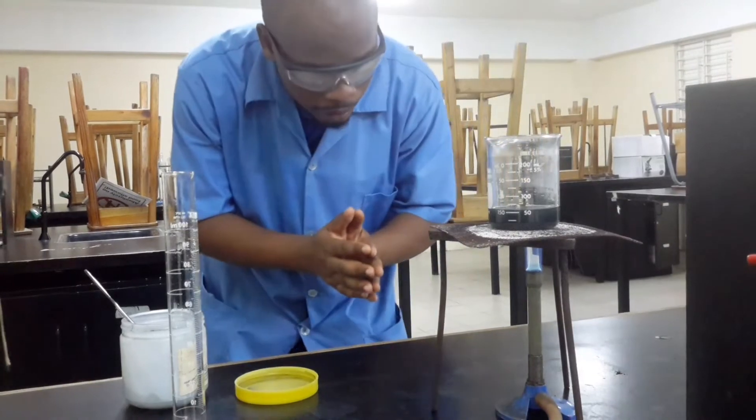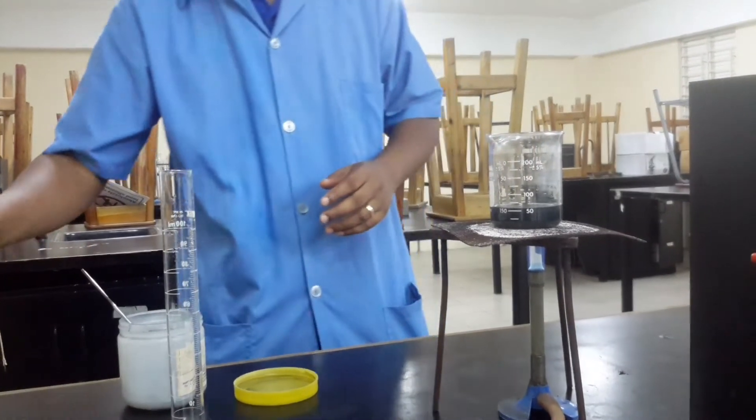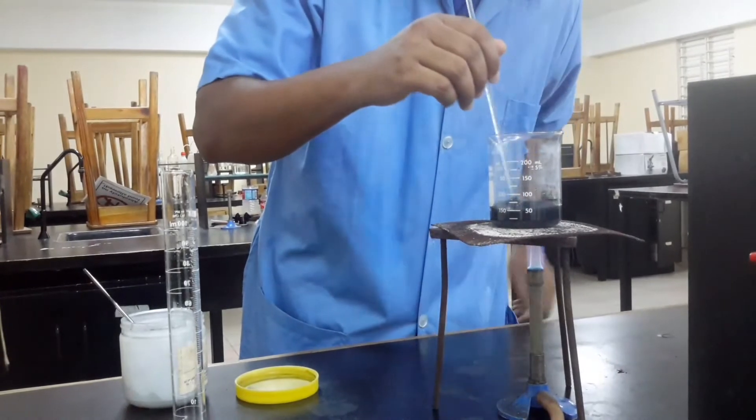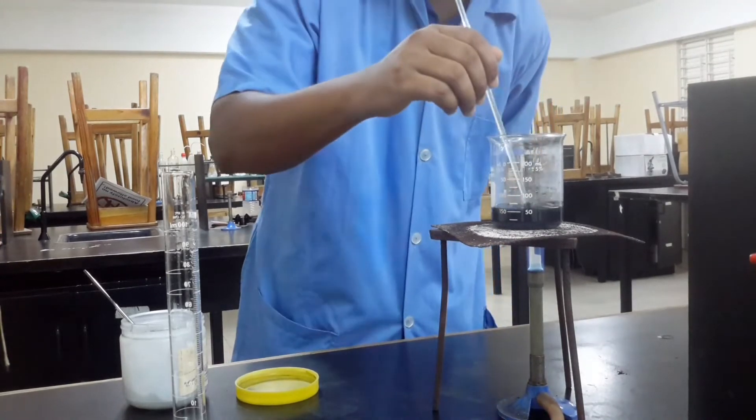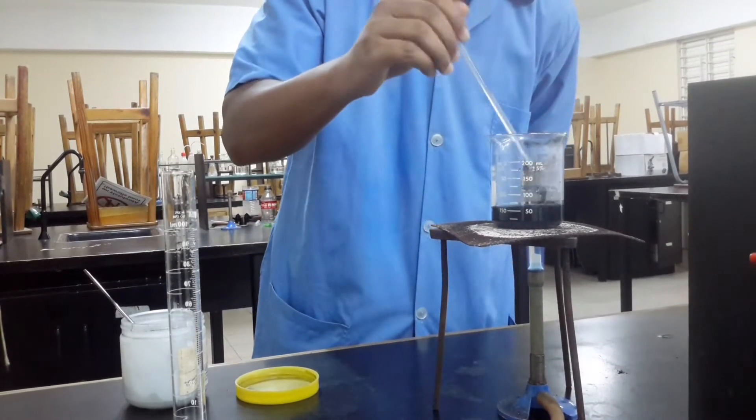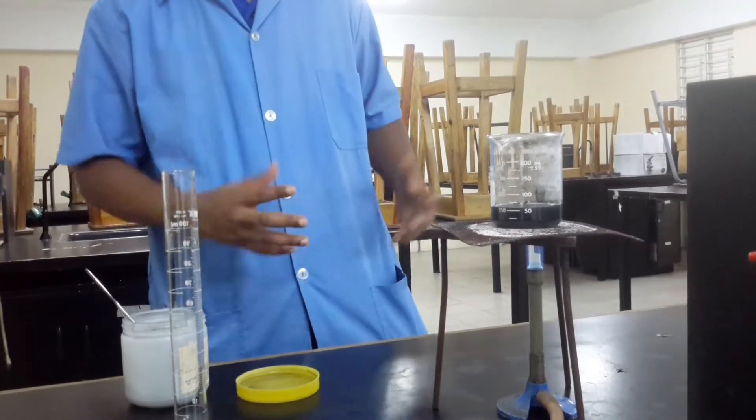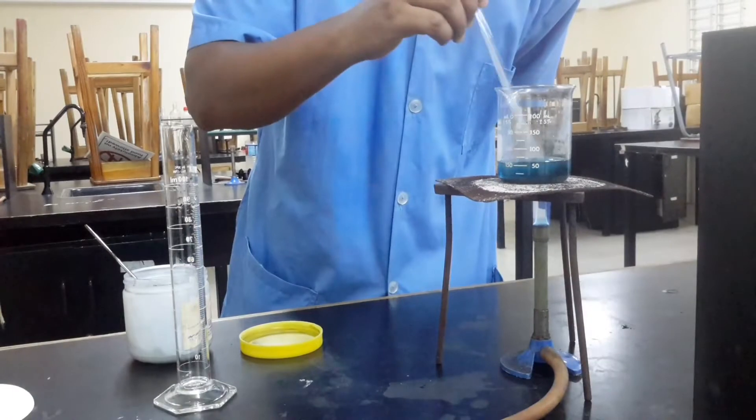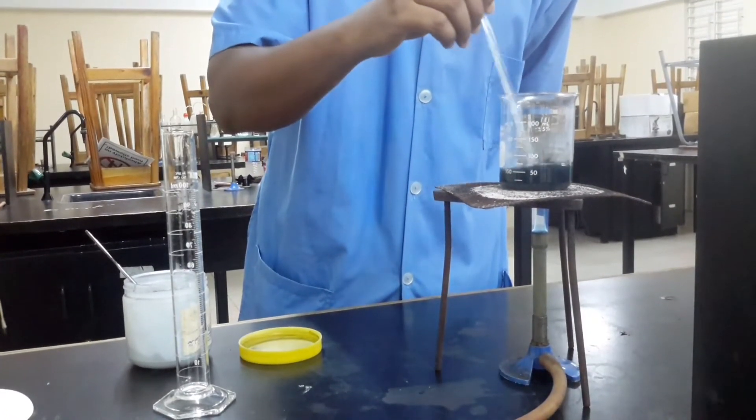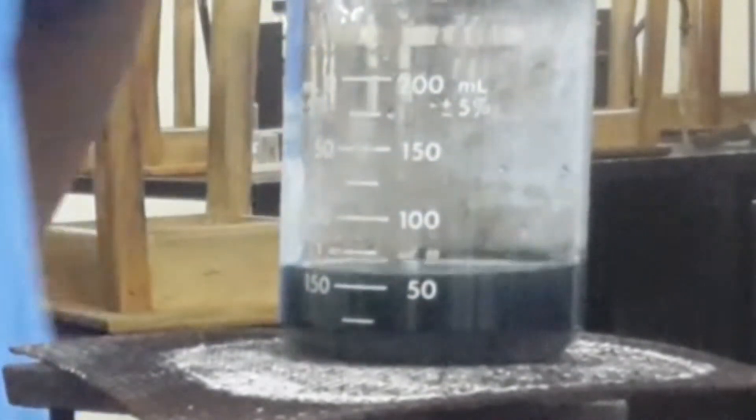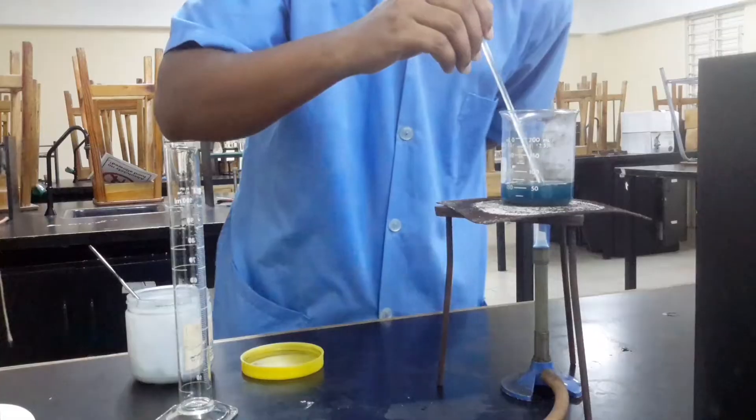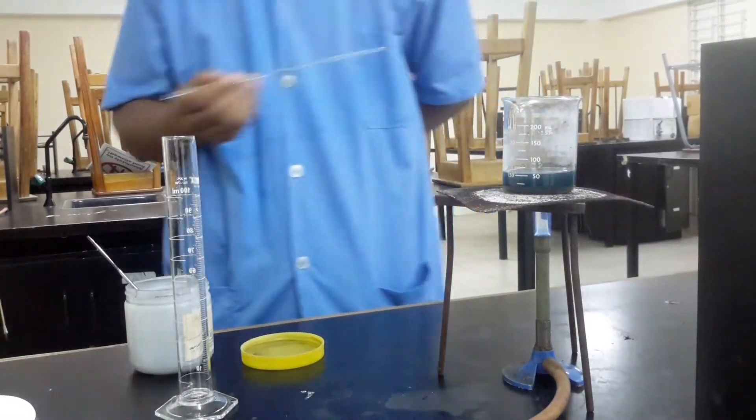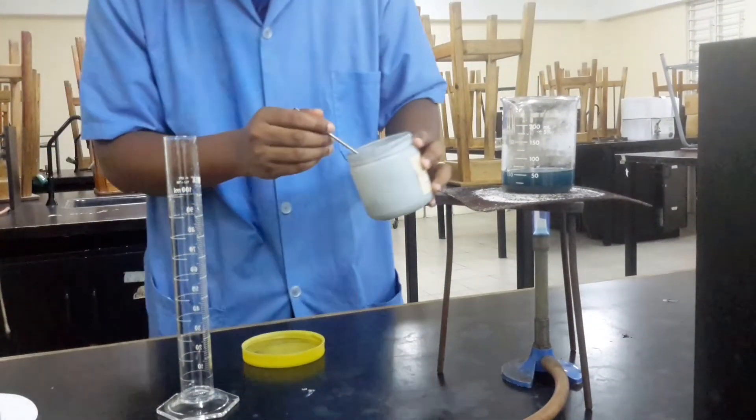We've added copper oxide until it's in excess but we're going to just give it a little time to heat up and see if we can get some more of it reacting. Let's just let the heat do its work and we wait. As the solid settles we're seeing a little blue. We can just add a little bit more copper oxide.